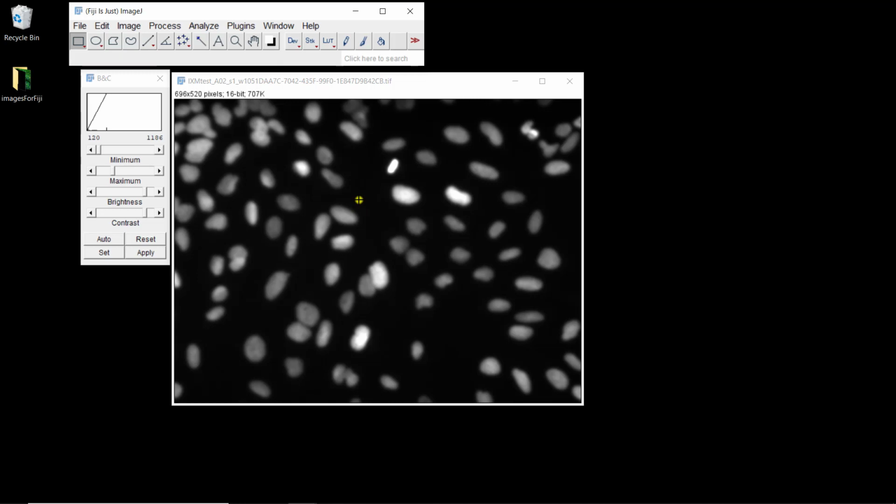The idea is that it's going to blur the image in the nuclei, so maybe we lose some information in the nuclei, even though the nuclei are still bright and pretty easy to identify from the background. We're going to also blur the intensity in the background. So now we have a smoother image that's going to be easier to deal with, especially if you have some noise.